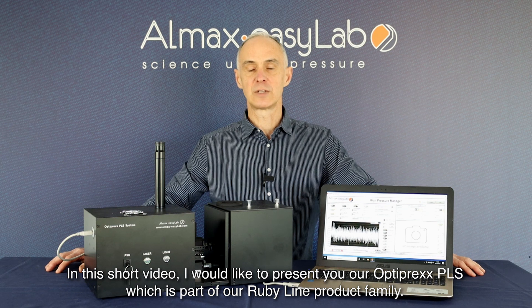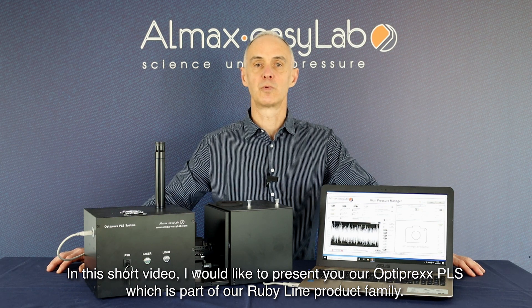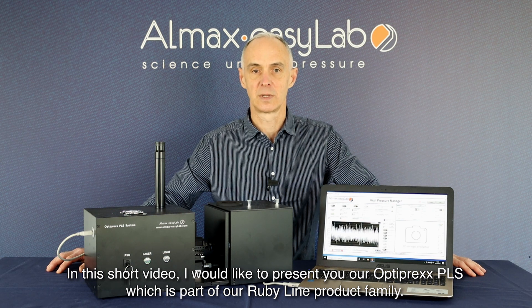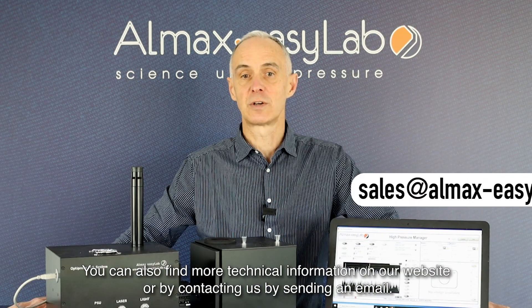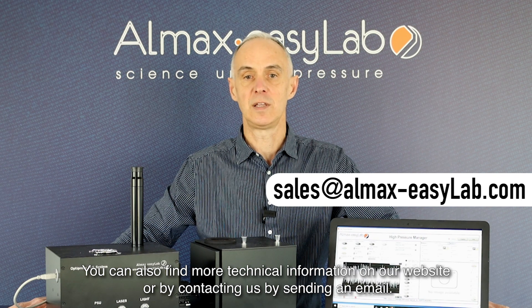In this short video, I would like to present our Optiprex PLS, which is part of our Ruby line product family. You can also find more technical information on our website or by contacting us via email.